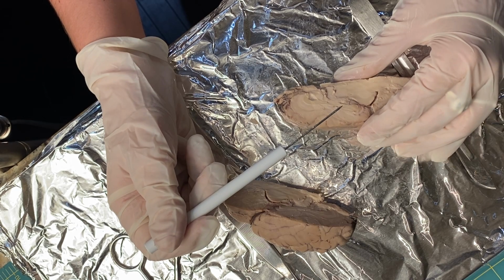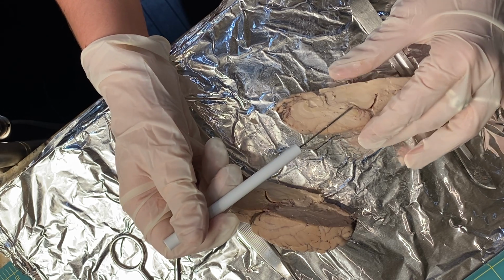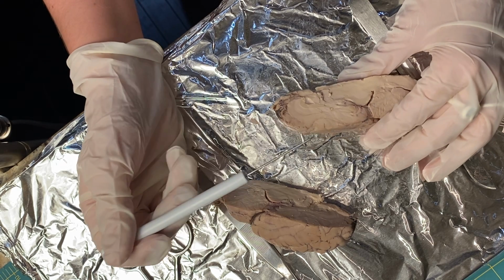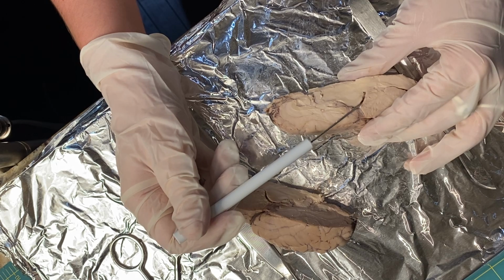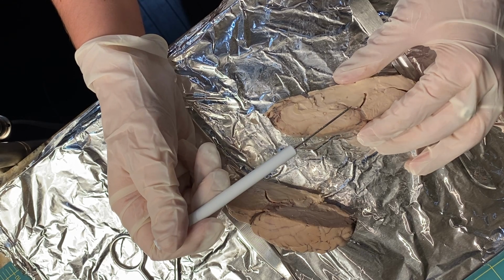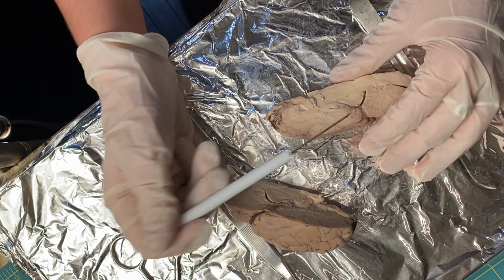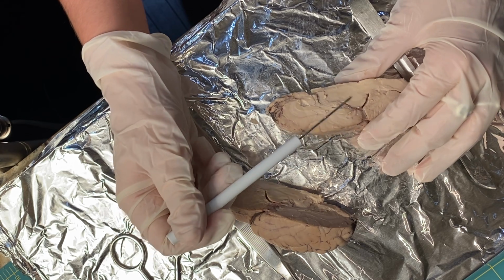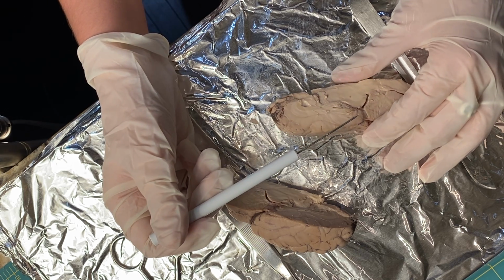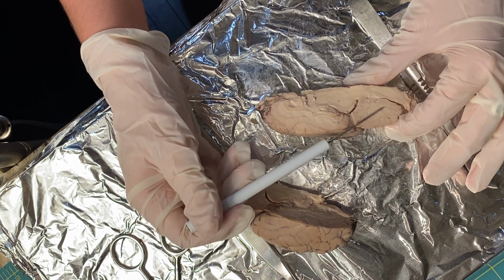And then right here we've got the pineal gland or pineal body, and that secretes melatonin, also is responsible for sleep. So over here, right here, we have the superior colliculus and the inferior colliculus. The superior colliculus controls head and neck reflexes to light stimuli, and the inferior colliculus controls head and neck reflexes to sound stimuli. Again, here is the cerebellum.